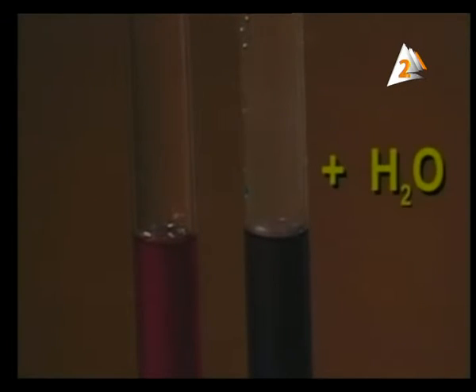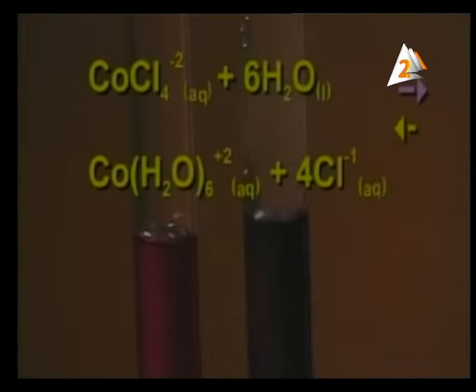This is the shift for this reaction. My lovely, these drops of water evolved in the tube of what color? Of blue color. This means it tries to return, to make a shift between the two sides of the reaction. Now, this is the important work of Le Chatelier. Do you think this is all?